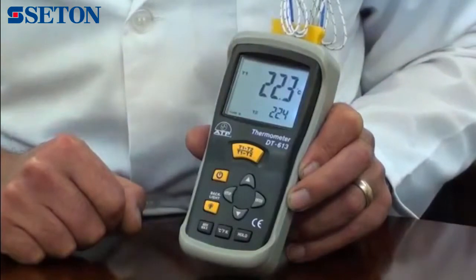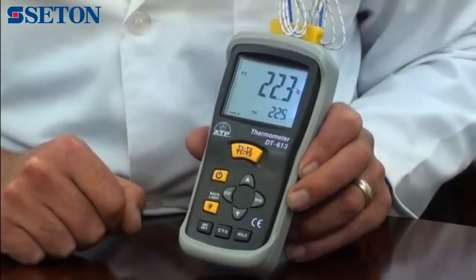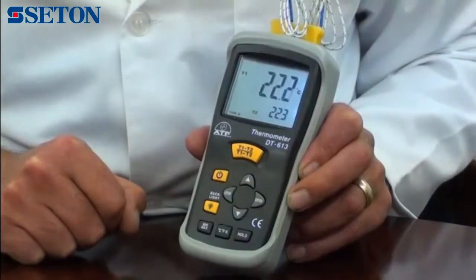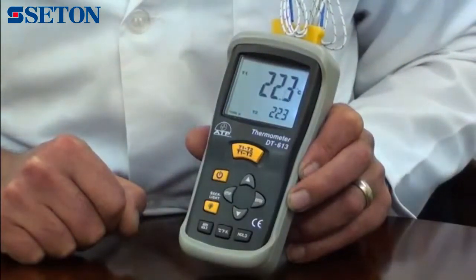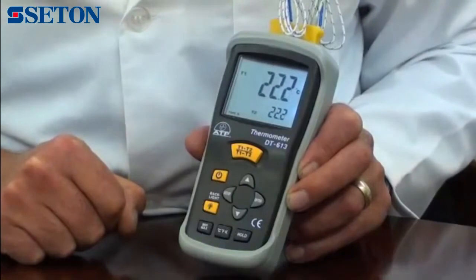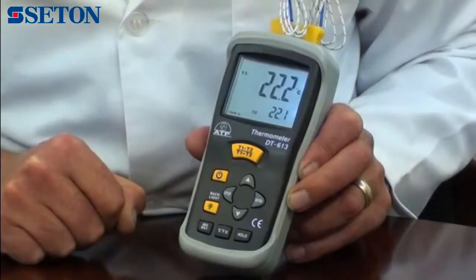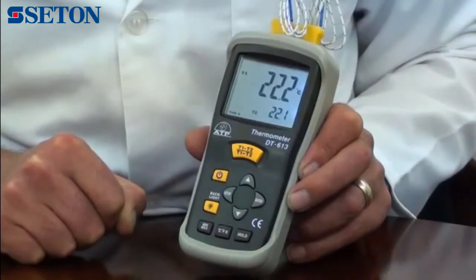It has an overall resolution of 1 degree, but has a selectable resolution of 0.1 degree or 1 degree below 200 degrees. The thermometer is high accuracy, being plus or minus 0.15% of reading, plus 1 degree C, above minus 100 degrees.